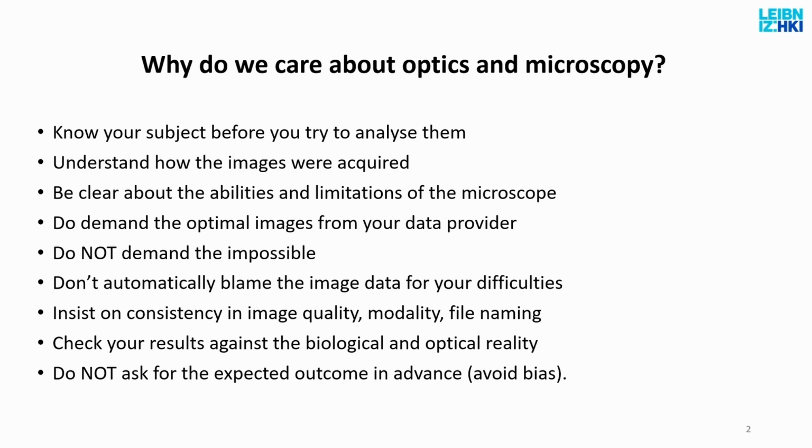But this also means that if you don't take advantage of your microscopy setup, then you are delaying your project. And like I said, we have cases where someone came with a set of data which were really not adequate for analysis, and then we ask, okay, can you redo them? No, because the PhD student graduated or the master student graduated, she is gone, it cannot be done. And then we do our best.